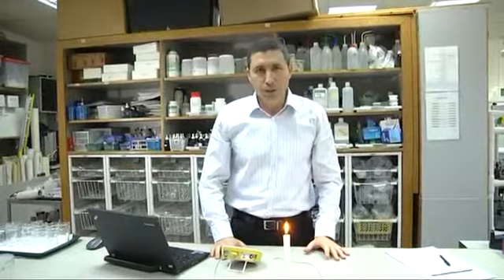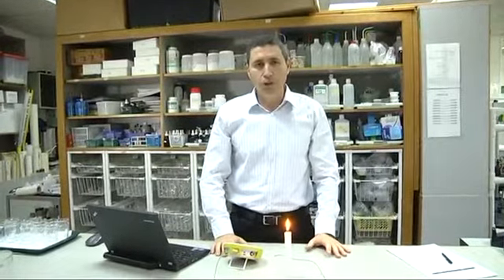Today, we are going to use the Labdisc, the thermocouple temperature sensor, and the candle to explore combustion, a chemical process in which a substance reacts with oxygen to produce heat. So what do you think? What is the temperature of a candle flame? Is it the same in all parts of the candle?